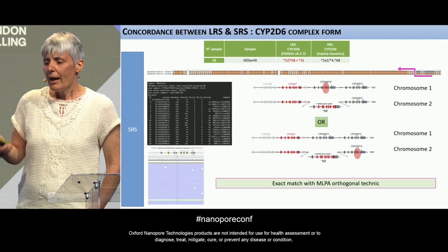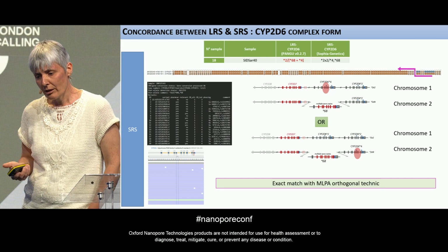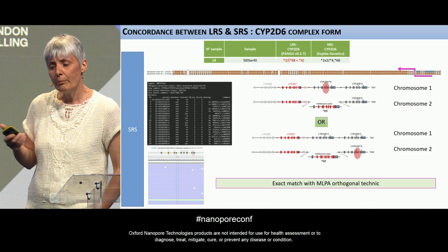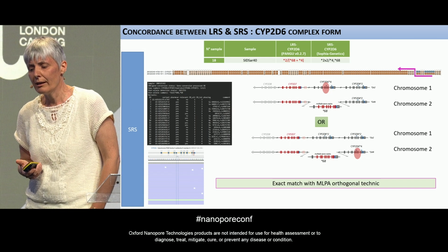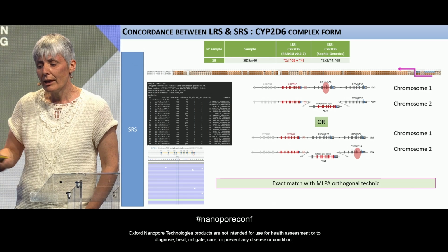So I would like just to highlight another example. In this example, we have a duplication of STAR2 and a hybrid, as you can see in this short data. But I'm not able, just with this data, to determine the configuration of each chromosome, because we have duplication and hybrids with other copies.